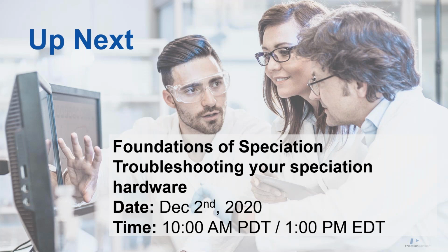When making an MSF model with multiple interference, will the model negatively affect results if some samples have some, but not all interference? That's a good question. So it should not, and you could verify that kind of the way we discussed by running standards and blanks after you get your model set up. Yeah, it shouldn't. Especially with MSF, IEC kind of always applies the correction if the interference is present over a certain concentration. But MSF actually is a deconvolution algorithm that tries to ascertain if that interferent is present or not. So if it doesn't think that the interferent is present by the deconvolution routine, it won't apply that correction model for that particular interference, if that makes sense.